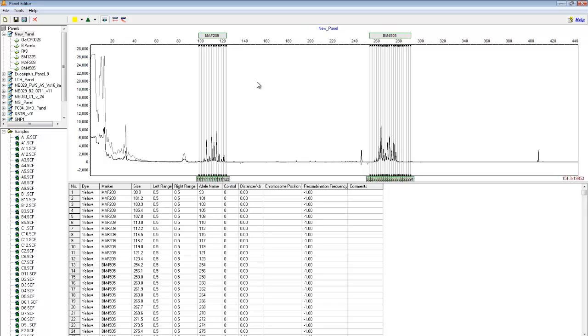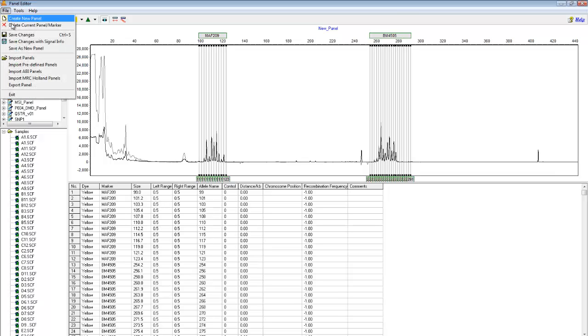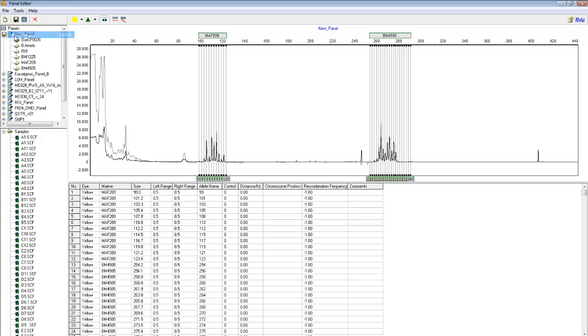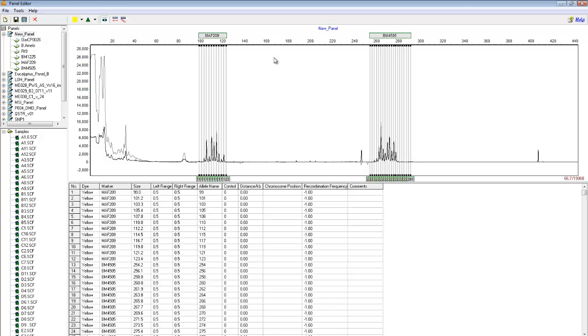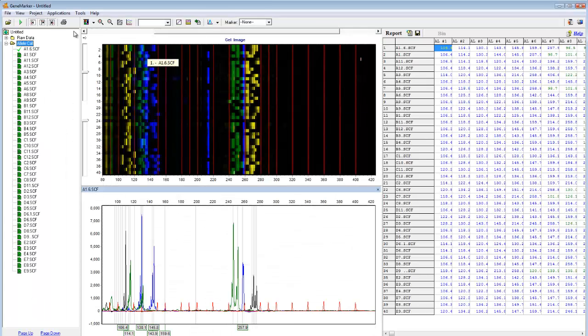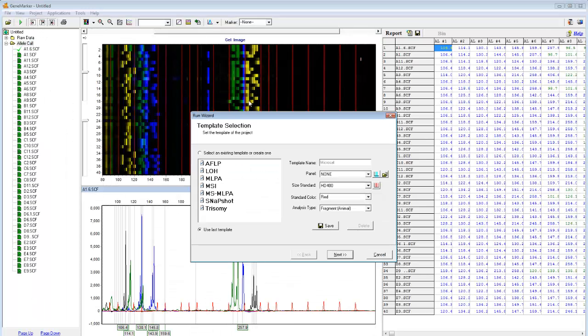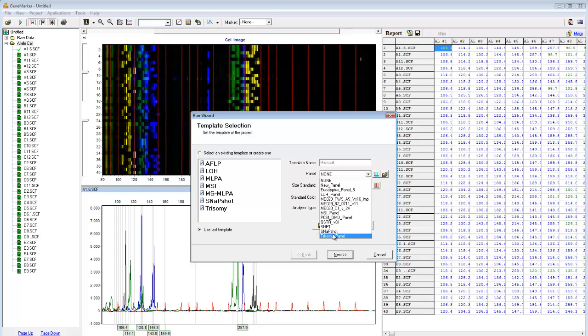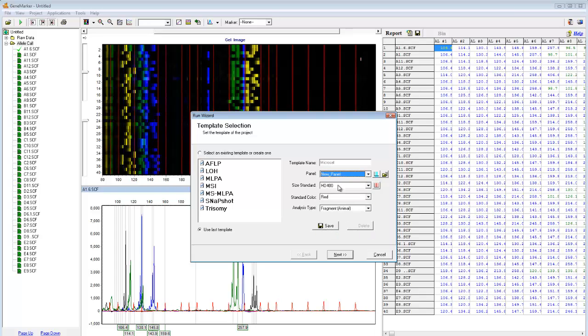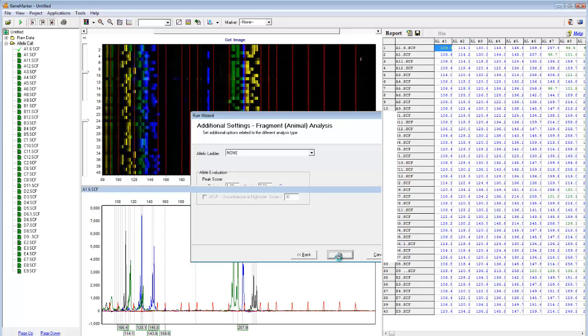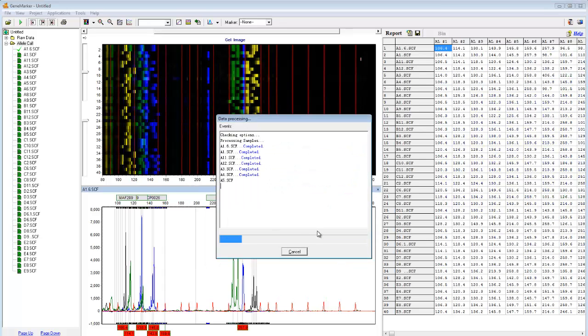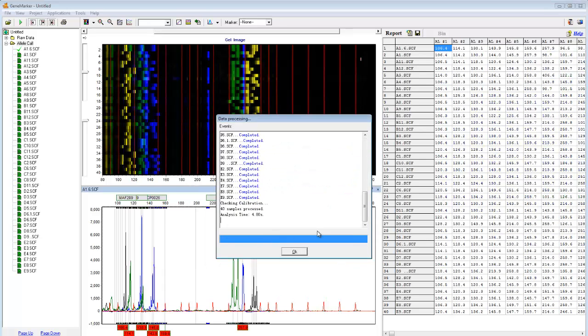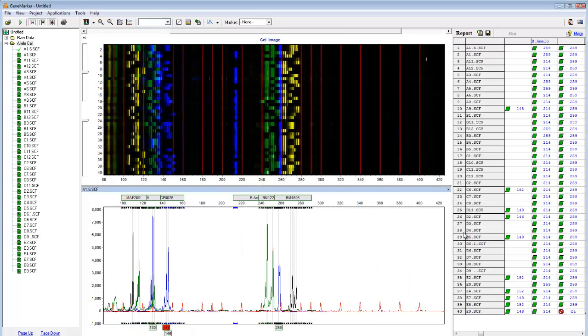Now that I've created this panel, I can run my data with it. First, I'll save the panel, and if necessary, you can export it as well. Now I'll return to the Run Wizard, and for my panel, I will select Newly Created Panel. Then I'll click Next, Next, and OK. Apply changes to all. And now I have successful size and allele calls, and I'm ready to proceed to post-genotyping applications.